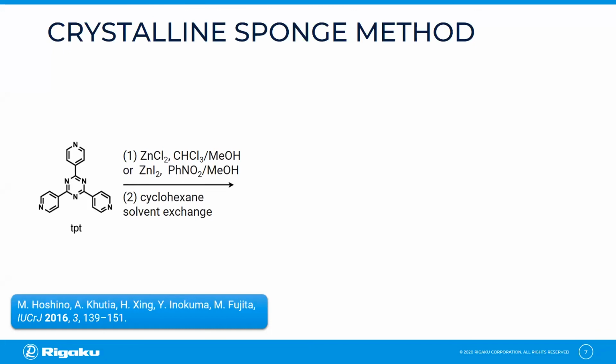The whole sponge method is very well described and documented in the IUCrJ journal publication from 2016. If you wish to read yourself into this topic deeply, then I recommend to begin with this article first.